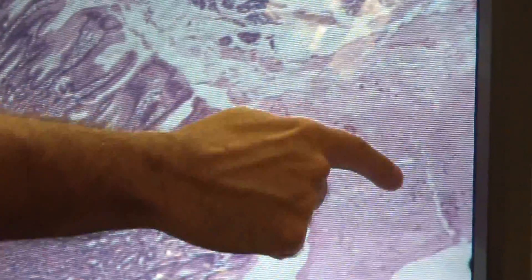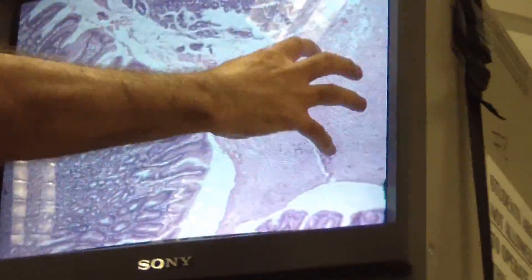Now that's the lumen. I'm not sure what's inside here when the technician took this slide, but that's the lumen right here. That's the mucosa because I can see all this. Can you all see the muscularis mucosa? See that thin layer of muscle right here.